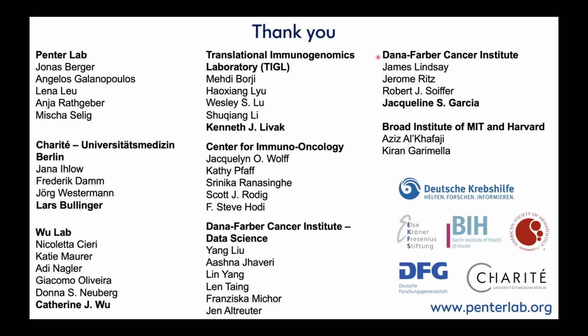Go ahead. Hey, hi. Thank you for the great talk. I do have one question regarding the pipeline. In the pipeline, you mentioned that a part of the cDNA and DNA, you take it to do the sequencing through your pipeline. Can you tell us how much do we require for the sequencing, the cDNA and DNA for your pipeline, NanoRanger? So the question is, how much cDNA do we need for this?